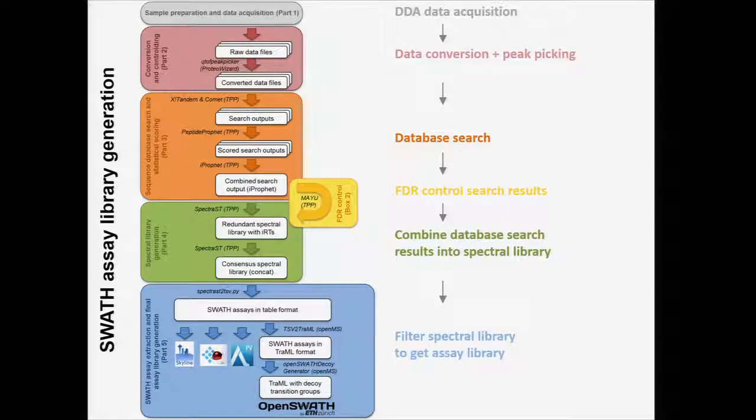I just want to take a few minutes to walk down through this. There are a lot of details and steps here, and I won't describe every one at a very low level of detail. I just want to say what each step is and a couple of things that you might want to watch out for. So this is the same again, right? You have some kind of sample preparation, data acquisition. We have some converting and centroiding going on here.